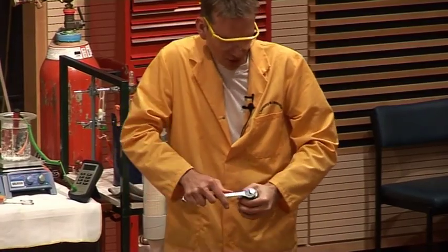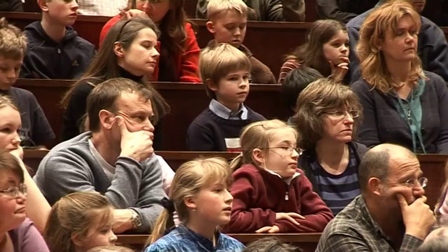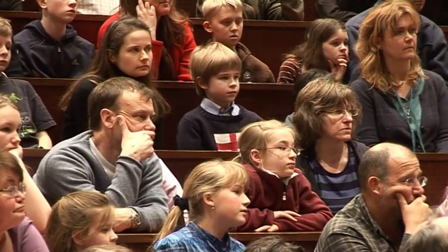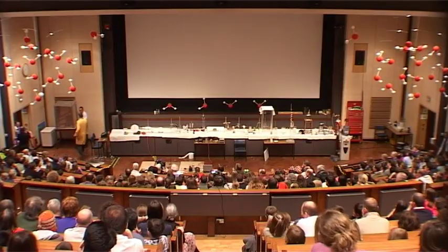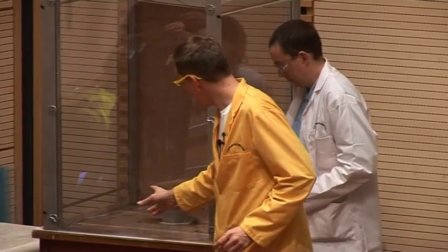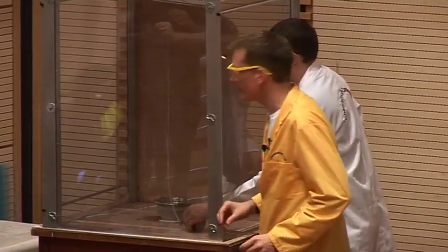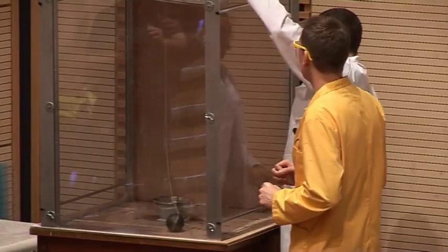So at the moment we've got the container filled with liquid water, but in a minute I'm going to freeze this to turn the liquid water into solid water, into ice. Now we're going to lower the metal container into this bath that contains a very, very cold liquid, so this is going to freeze the water.